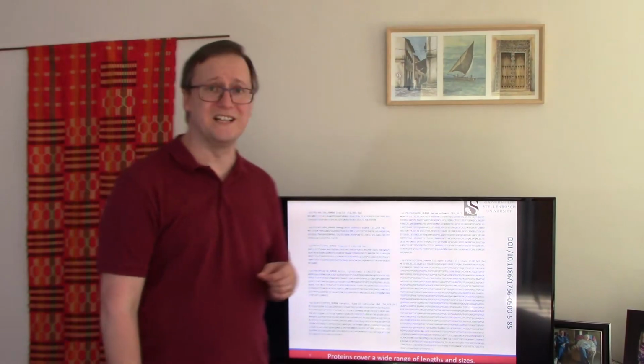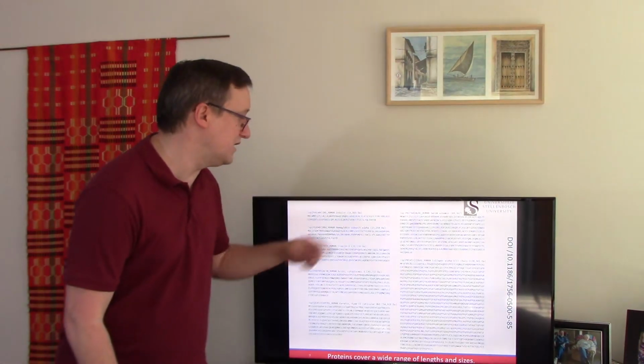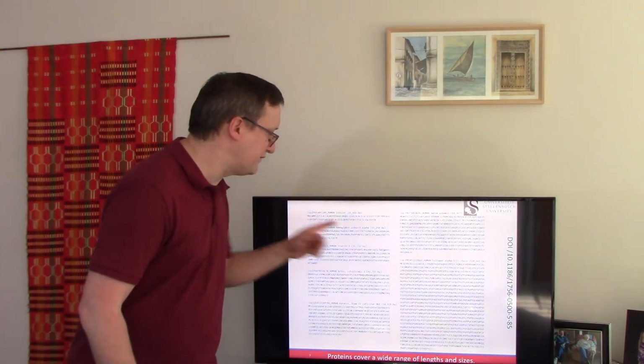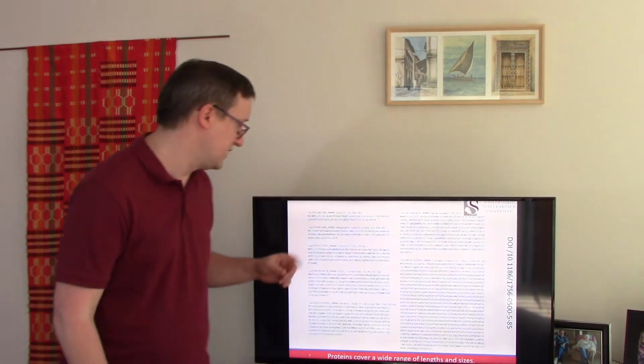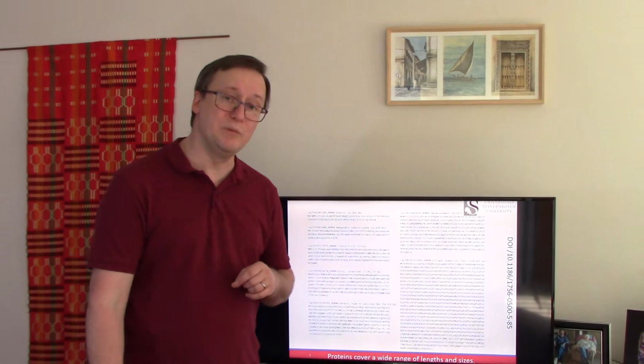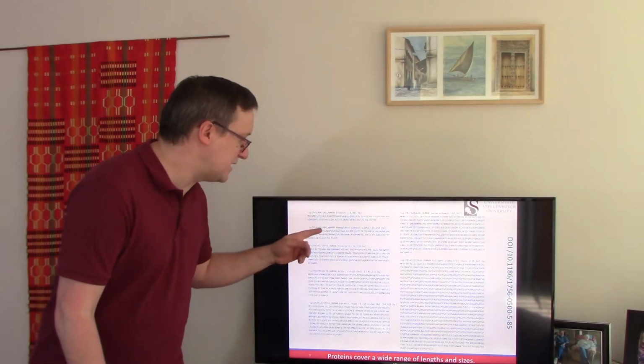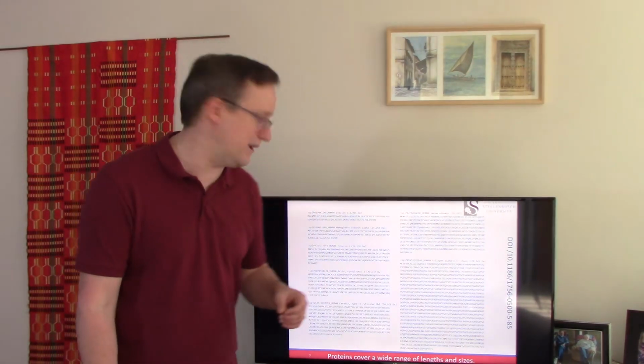So we start with our friend insulin. I believe insulin may have been the very first protein sequenced, unless I missed my guess. Was it myoglobin or was it insulin? Anyway, insulin is very, very short. Here we see that in just under 12,000 Daltons, we have this sequence running from here to here, just 2 lines of a FASTA file. It's a very, very small protein. From there we can go to something like hemoglobin subunit alpha. This is a 15.25 kilodalton protein, and we see that it takes up about 2.5 lines within our FASTA file.